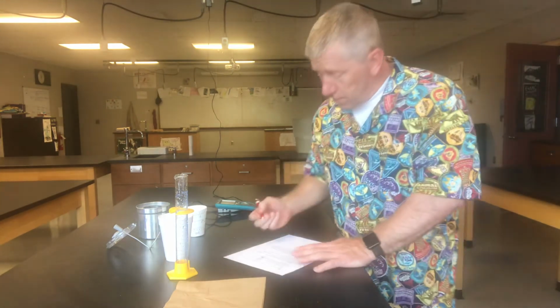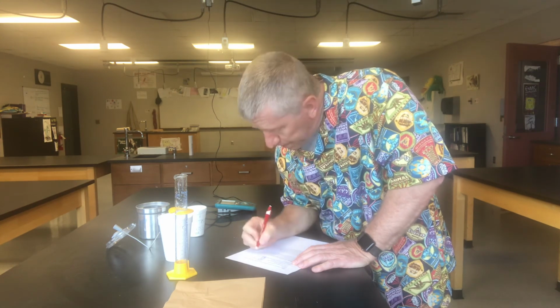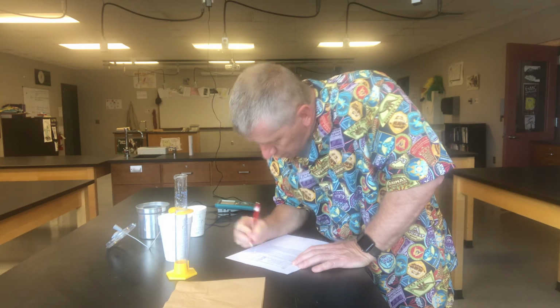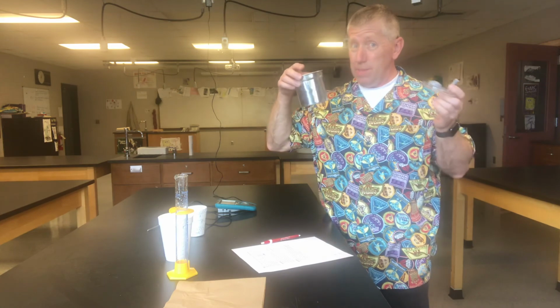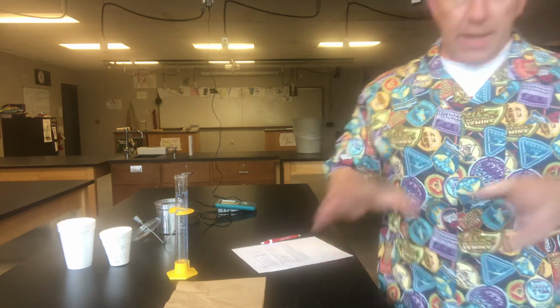We're going to do 2 trials. Remember, we said we would do 2 trials. So I'm going to put a line here, and we're going to put a set. You're going to have to write this in yourself, lab partner, for the second trial. Grams, Celsius, Celsius, Celsius, Celsius, grams and grams. So I'll go ahead and just put that in there. We're going to do trial 2. Now for trial 2, I'm going to use the more expensive calorimeter. We're going to lather, rinse, and repeat. Do the same thing that I did this time. So I'll be back in just a minute, getting you all ready for trial 2.